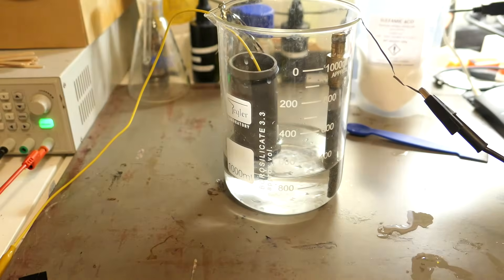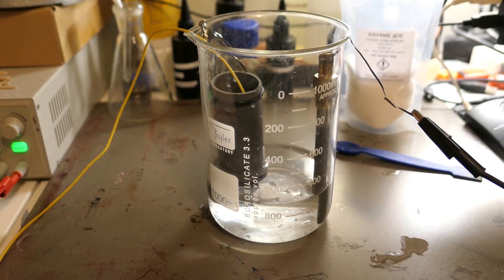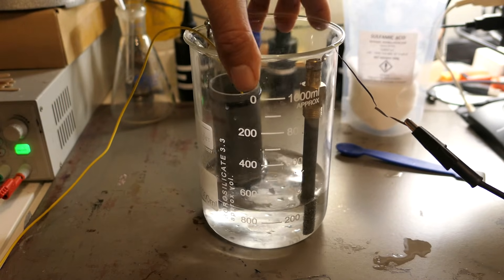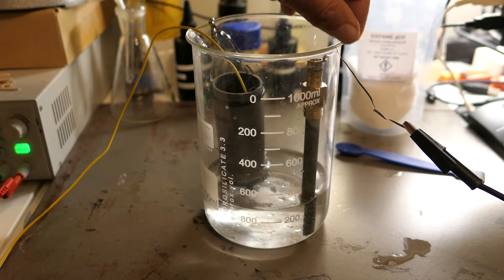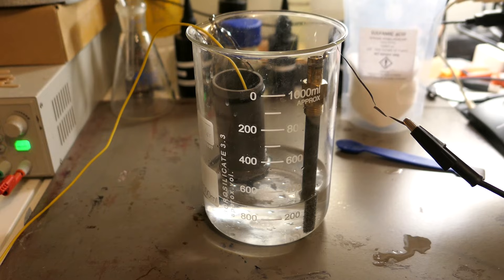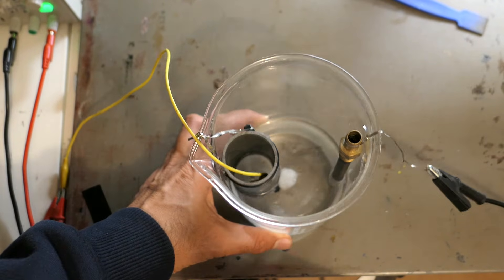As the electrolysis progresses, you'll notice a couple of things happening. First, the silver object at the anode will begin to refine and slowly dissolve into the electrolyte. At the same time, the solution itself will start to take on a slight blue tint. This is likely due to small amounts of copper ions being released from the anode as copper impurities dissolve into the solution.